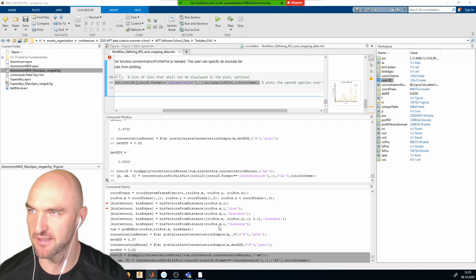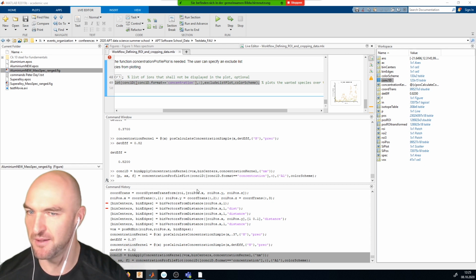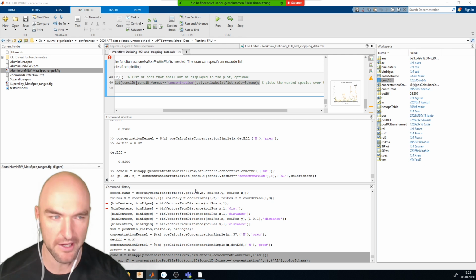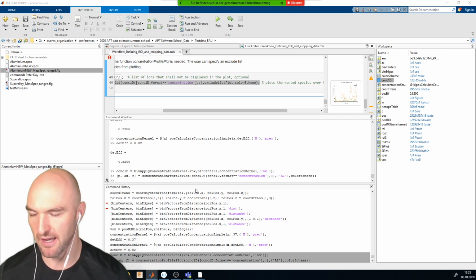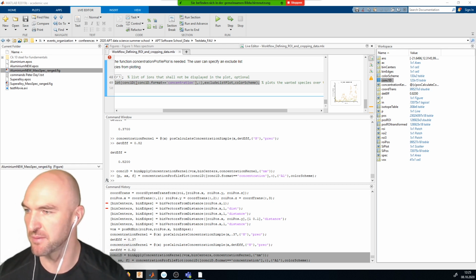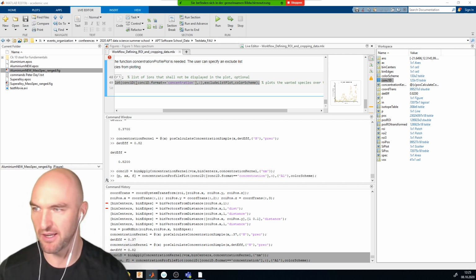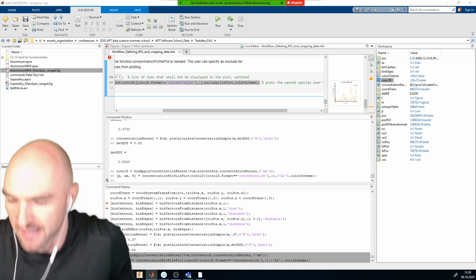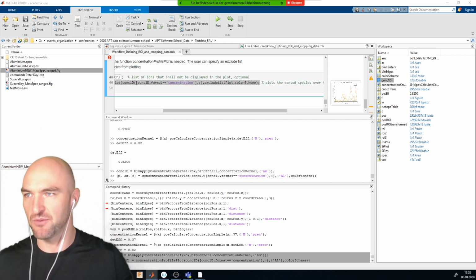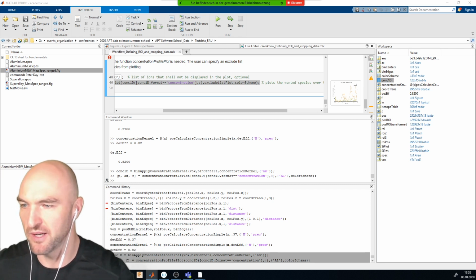So after the lunch break, we will then continue with some more advanced analysis, where we are going to be looking into doing maybe a radial profile and doing a 2D concentration map and a voxelization possibly as well. Okay, so are there questions about the regions of interest? I think we've collected also some very interesting ideas. So if you have ideas of where you think, okay, maybe I could do it, maybe there would be a way to do something else.